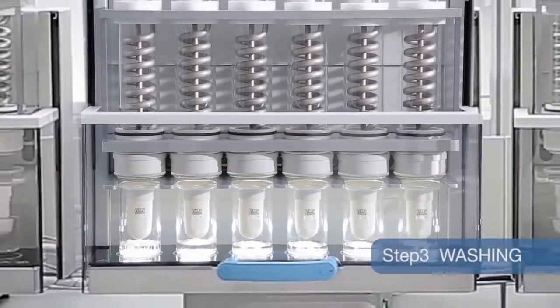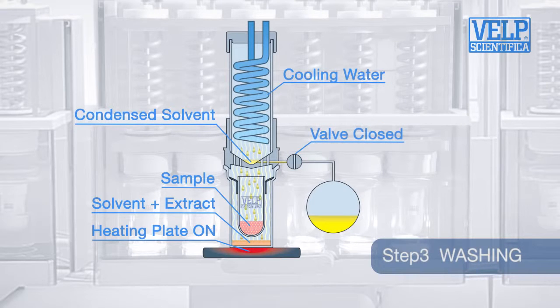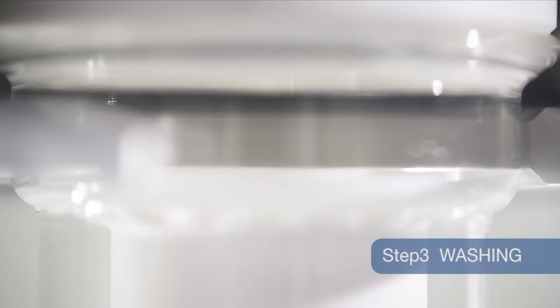During washing, the condensed solvent flows over the sample and through the thimble to complete the extraction process.